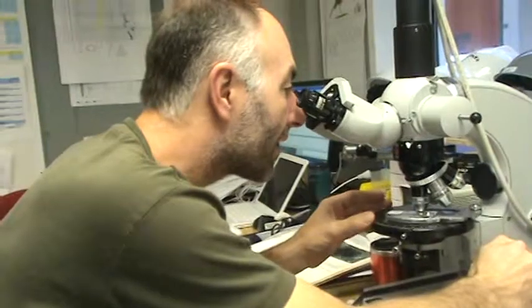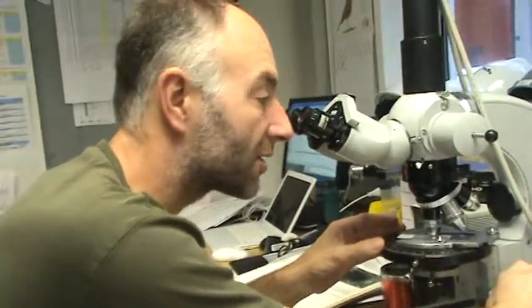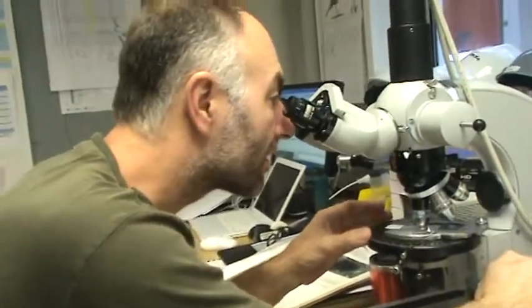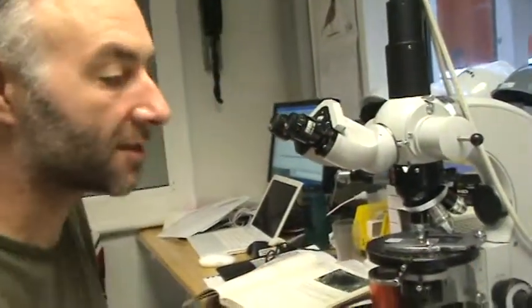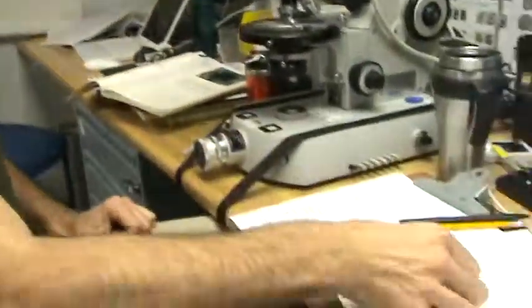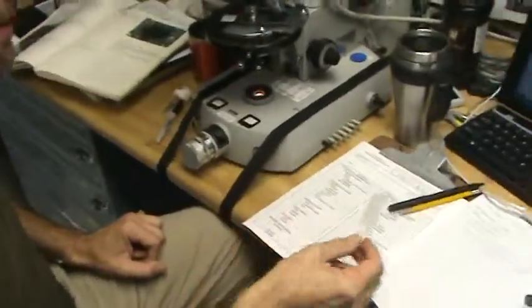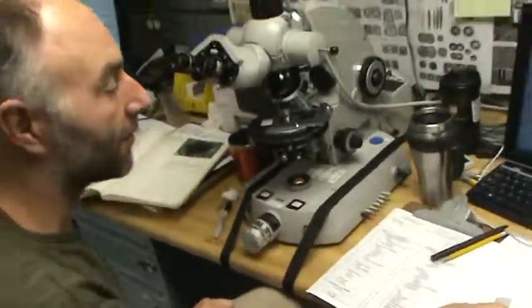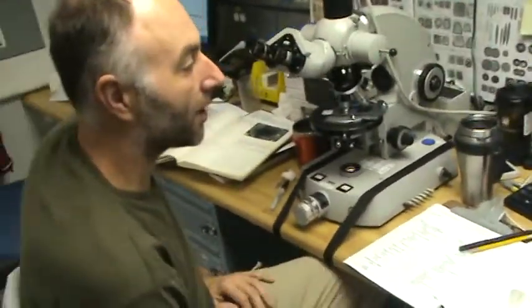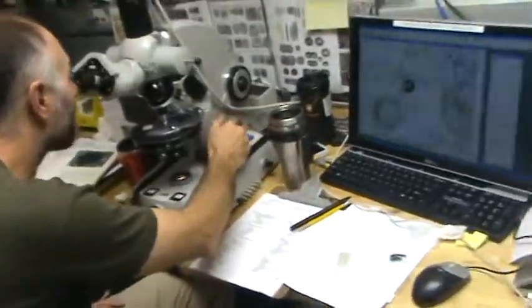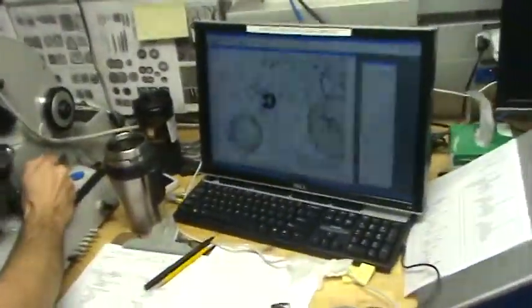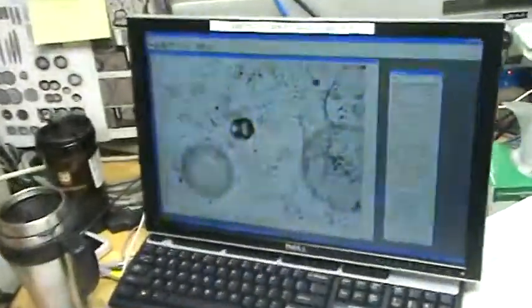Well, I'm analyzing smear slides. So we take little chunks of sediment and smear it on a glass slide, and then we dry them up and put them under the microscope. That's what you're seeing right now. Very cool.